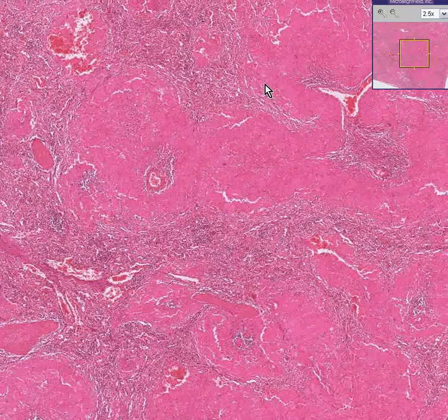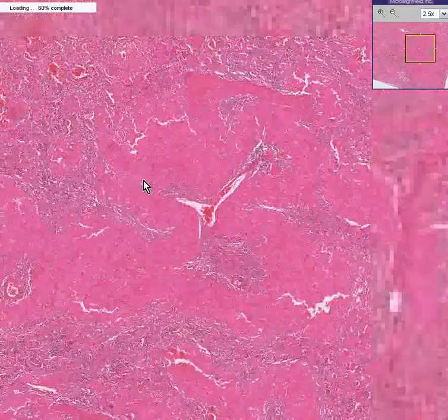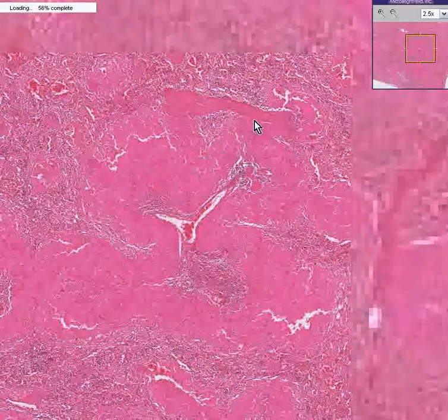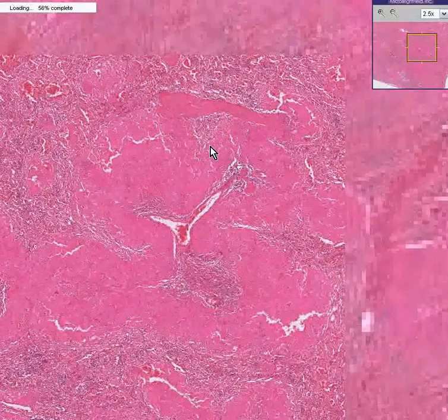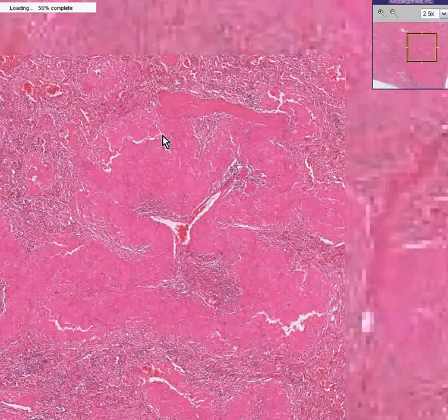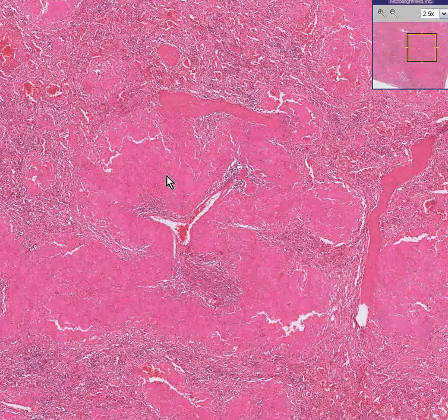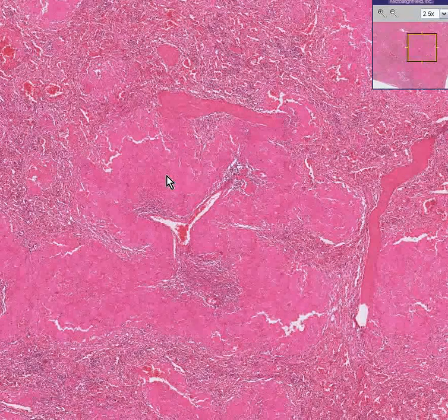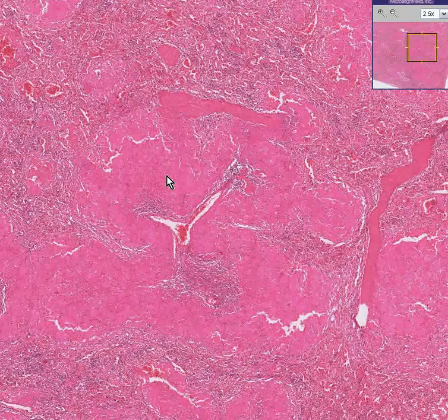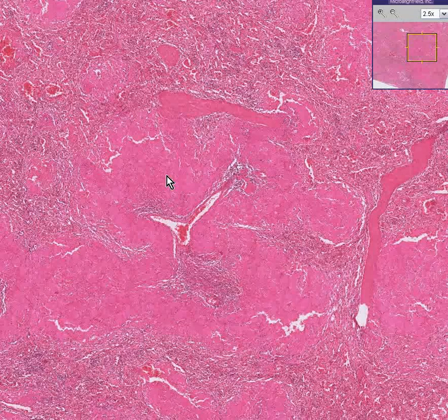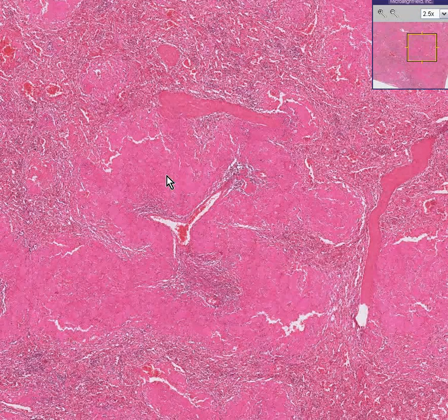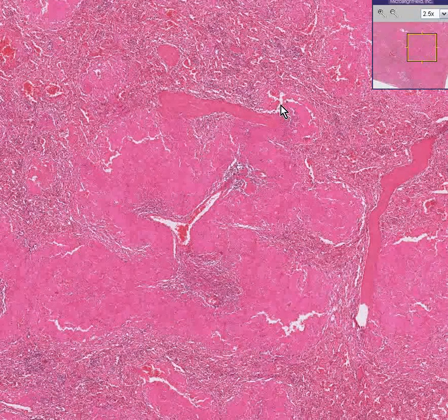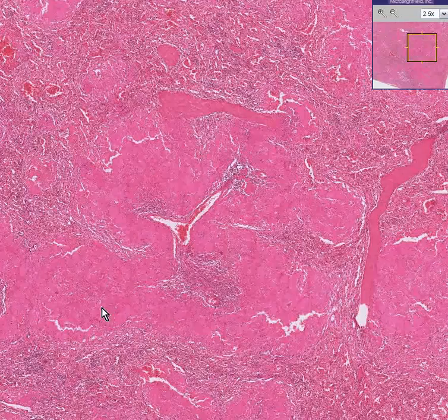And if you were to do a stain on this hyaline material — a Congo red stain — and then you polarized it, you would then see that it would be apple green birefringence.